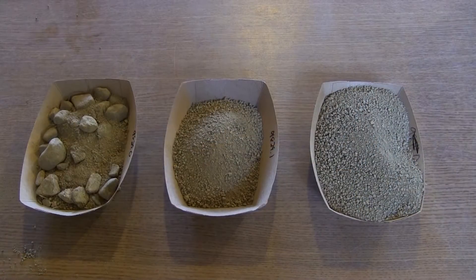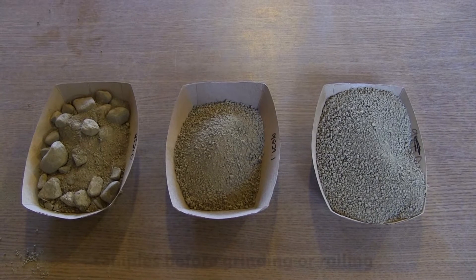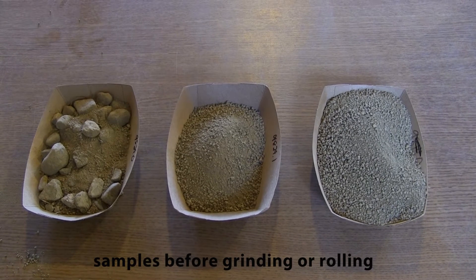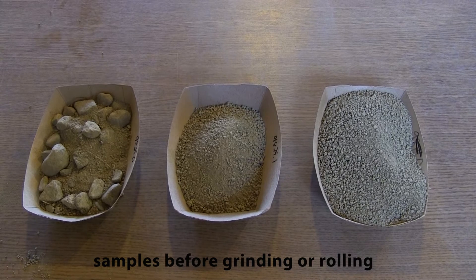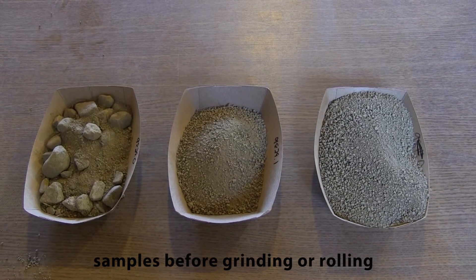To illustrate the severity of commonly used soil preparation methods, we took the same soil: as originally sampled with stones left in, sieved it and ground it in the middle, or only rolled and sieved it on the right.